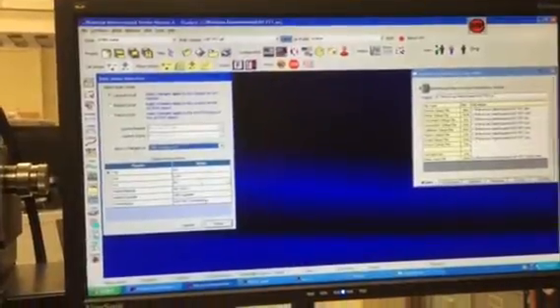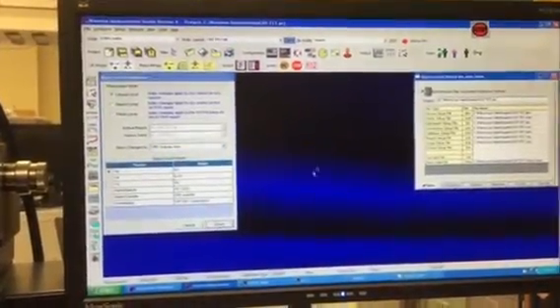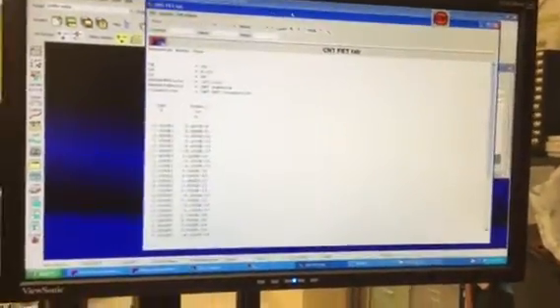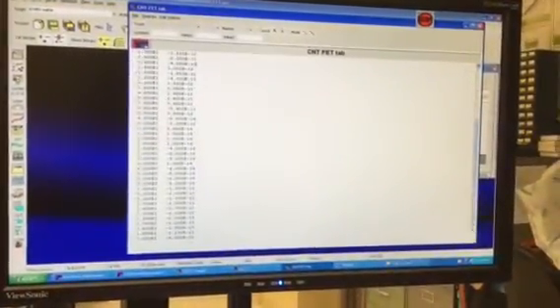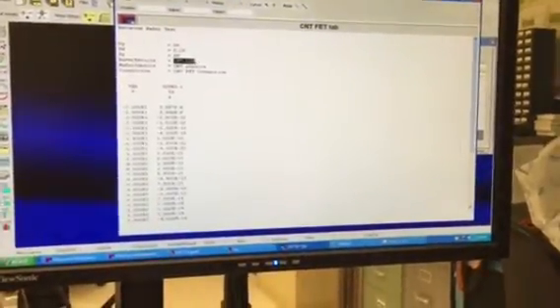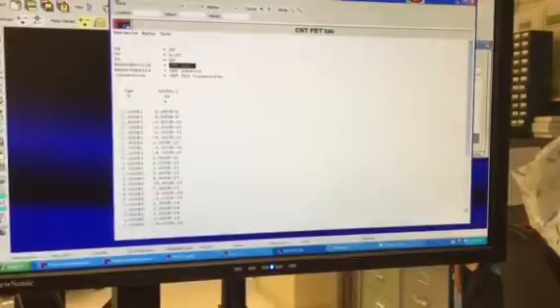Maybe just try one first and then see. So you're basically getting the VG in that. At the very top, it's telling you what reticle. You could parse that out if you needed it. But now let's go do all of them.